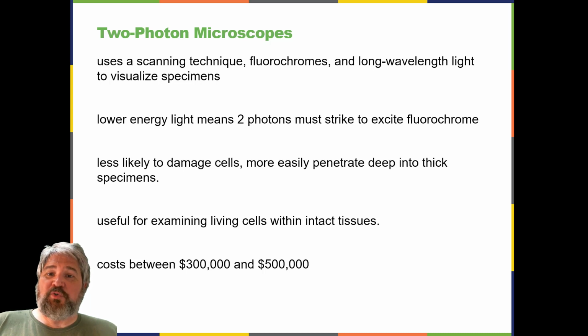This limitation was greatly reduced in the confocal microscope through the use of a confocal pinhole to reject out-of-focus background fluorescence with thin, less than 1 micrometer, unblurred optical sections. However, even the confocal microscope lacked the resolution needed for viewing thick tissue samples.